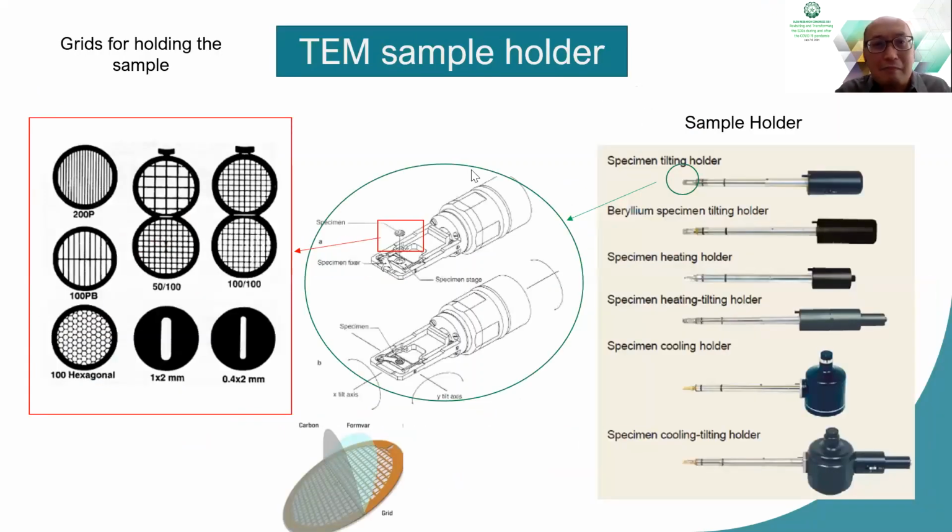These very thin samples are placed on a copper grid, with carbon film and Formvar, to hold the sample on the grid spaces. This grid is about 3 millimeters in diameter, and it is placed into a holder, locked into place, and the holder is inserted into the middle of the column.